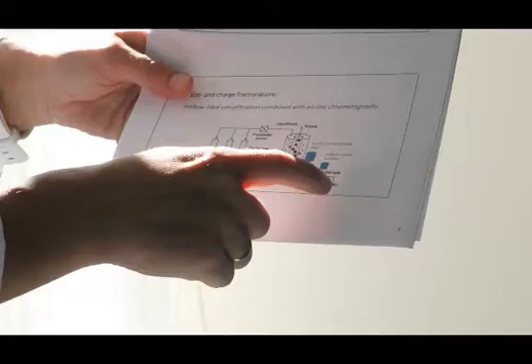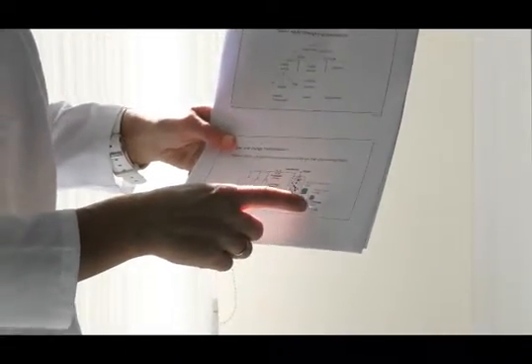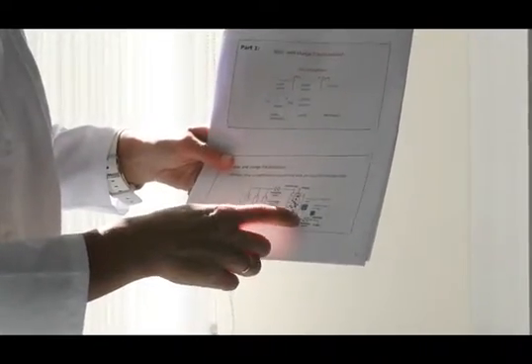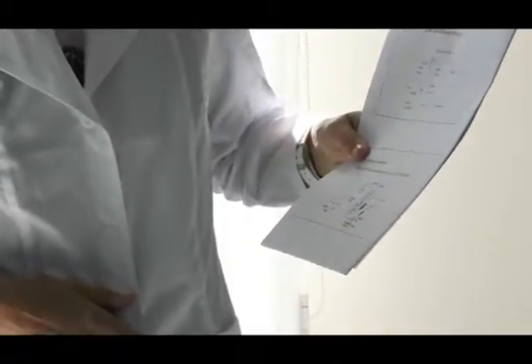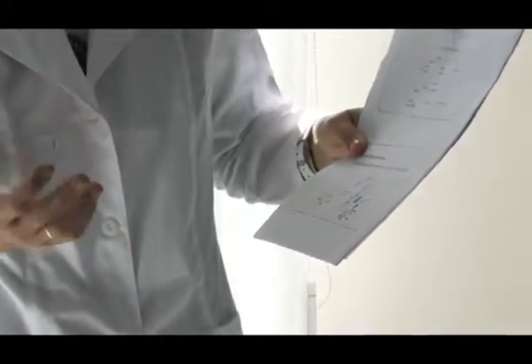So we have a pump. We go out in the field and pump the water through the 0.45 micrometer filter. But before we do that, we prefer to have a pre-filter to just remove plant parts and whatever could be in the water. So we use this small nylon filter.